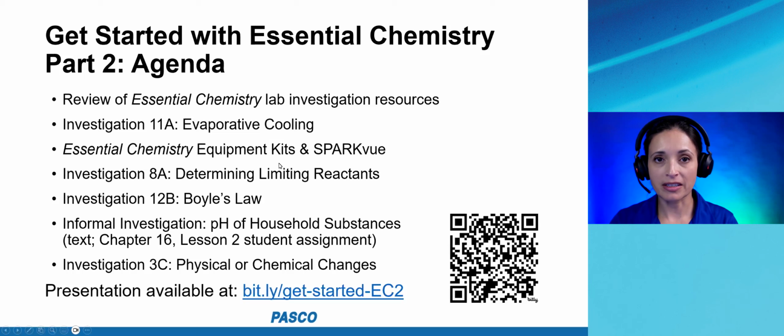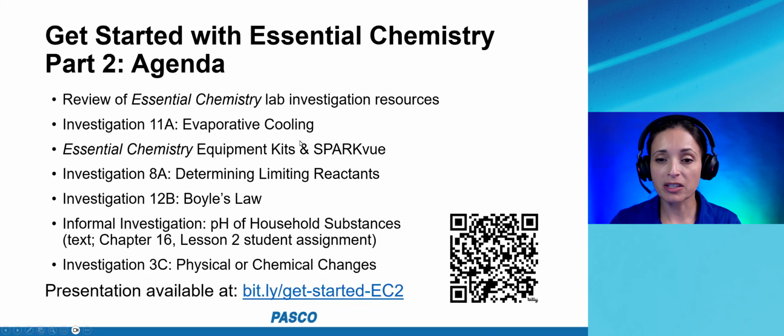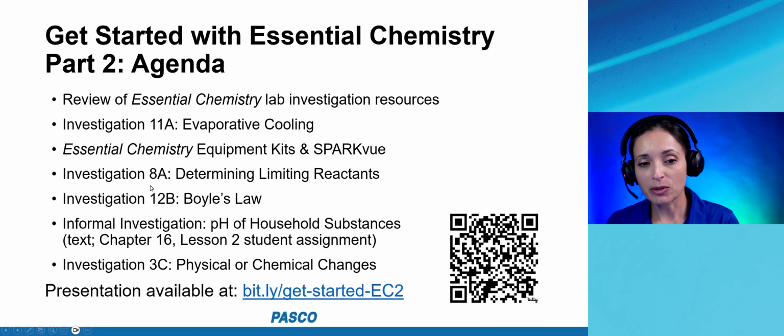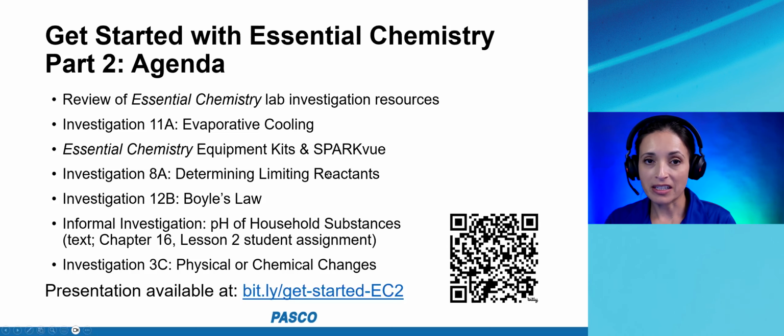Then I'll talk about the types of equipment you can get in the equipment kits that are built to go with the Essential Chemistry curriculum and the SPARKvue software, followed by Investigation 8A, a stoichiometry lab determining limiting reactants. And in that, I will demonstrate shared session, where if you're attending live, you could jump in if you'd like.